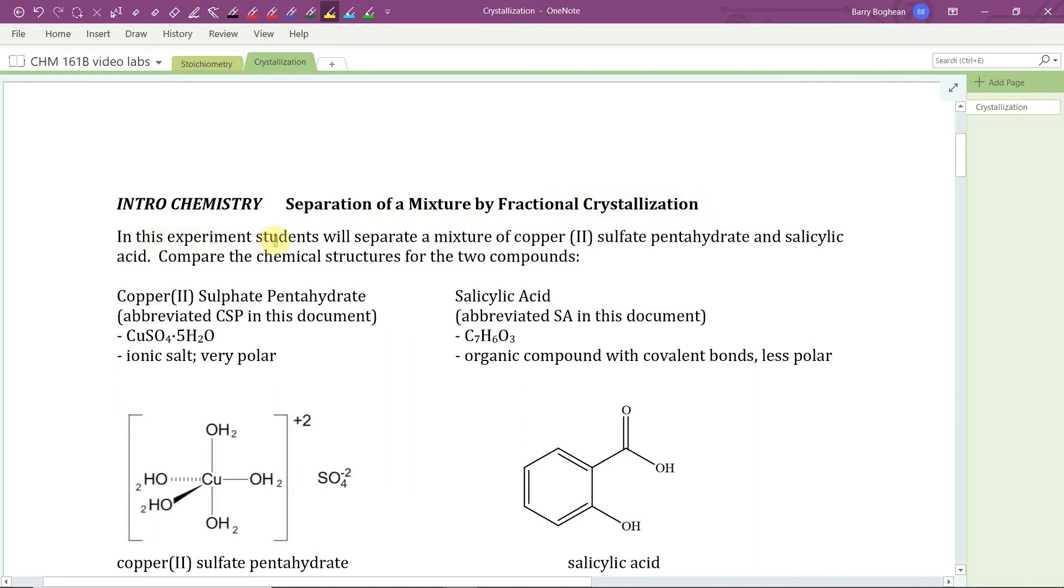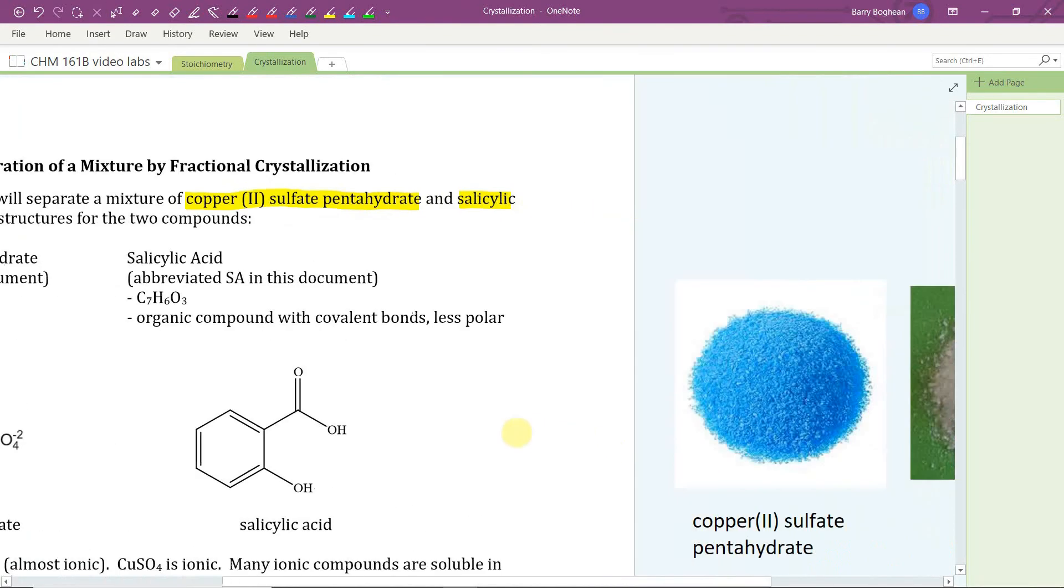In this experiment, we will separate a mixture of copper(II) sulfate pentahydrate and salicylic acid.